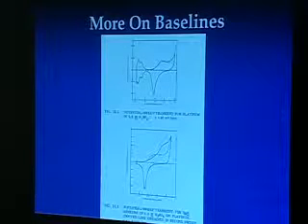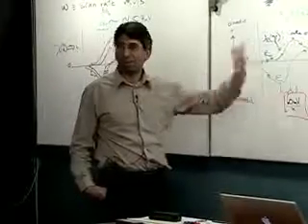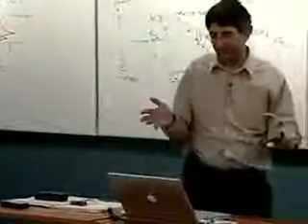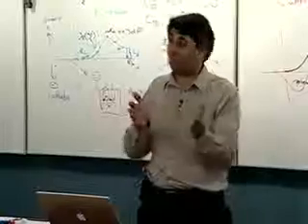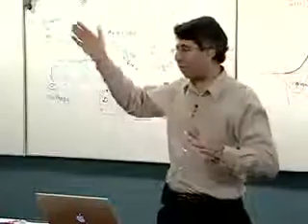Okay, that's the baseline. Now, one thing I haven't really said too much about is, I gave you a range of scan rates that you might think about, but what are the normal ones? Most people start around 100 millivolts per second for their first scan rate. That seems to be a convenient number. It's easy to access, and often will hit the exciting region of the cyclic voltammogram. And then going down to 20 or 50 millivolts up to 500 or 1 volt per second is pretty straightforward.